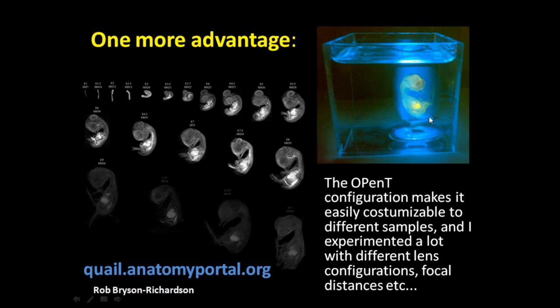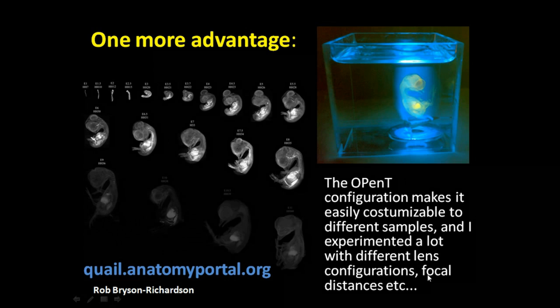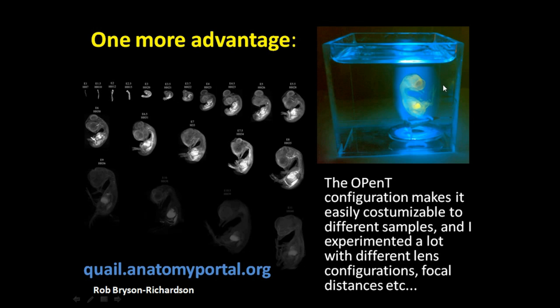Then it's glued to a little piece of glass, which in turn is glued to a piece of metal. This metal washer connects to the magnet and the motor. So when this is operating, the embryo is flipped 180 degrees and suspended in space as the camera is acquiring. What you're seeing here is something equivalent to what the camera would see when it looks at the sample.